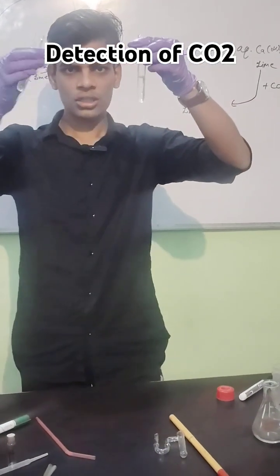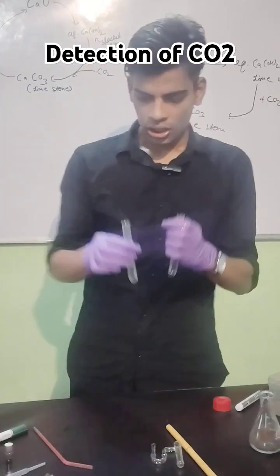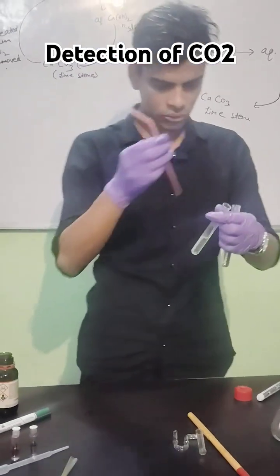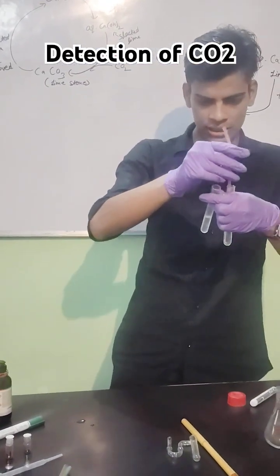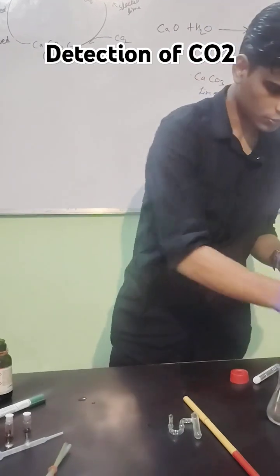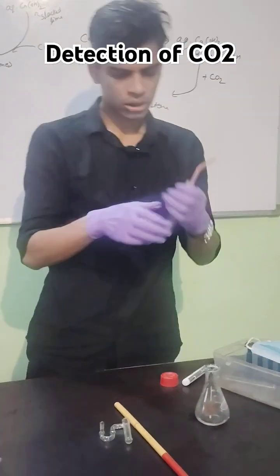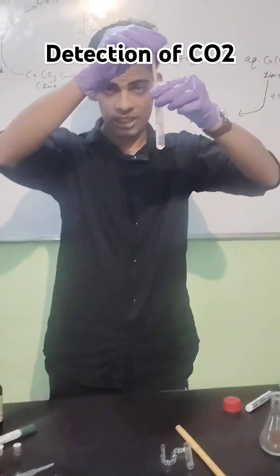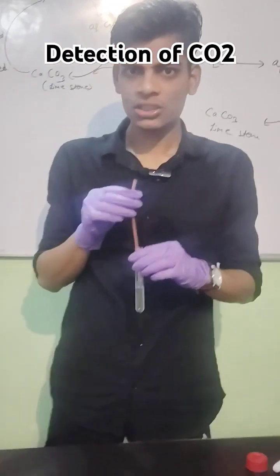You can clearly observe when we exhale CO2. I want to keep it here. Then you can see this is transparent color before we exhale CO2.